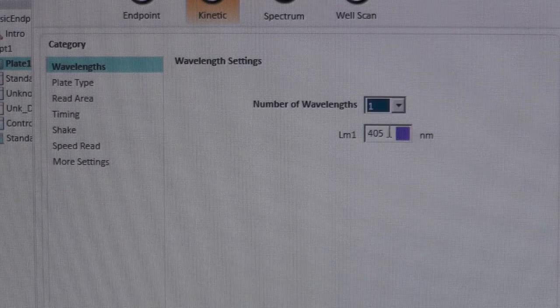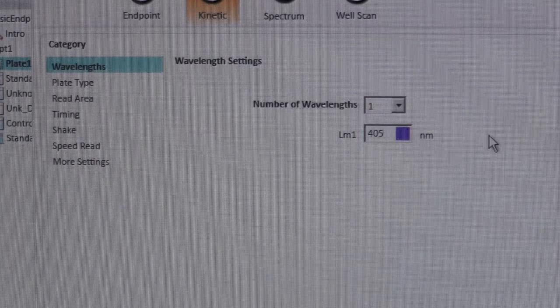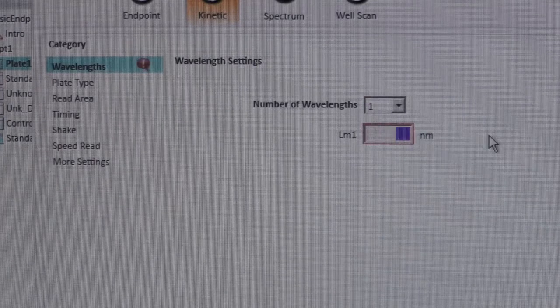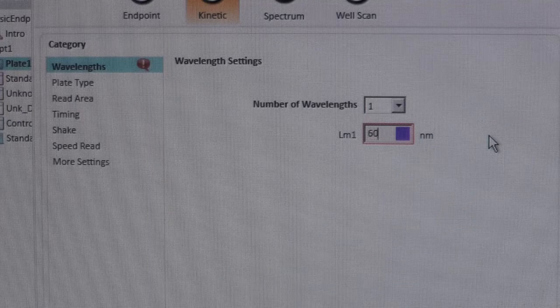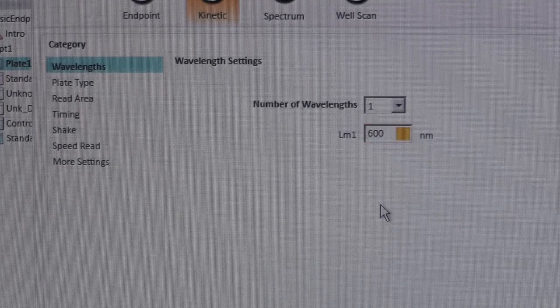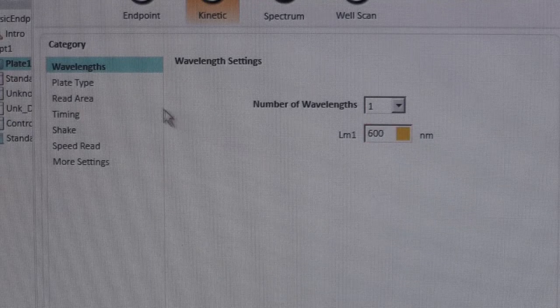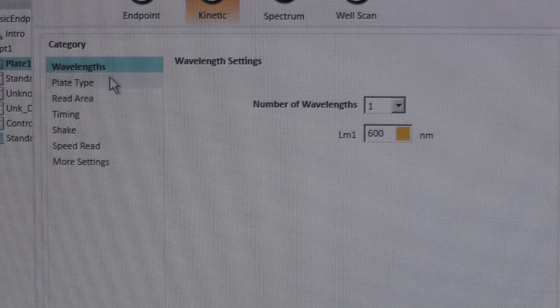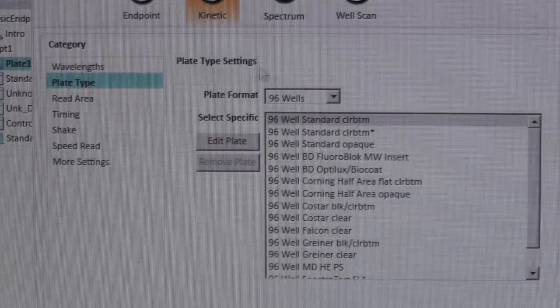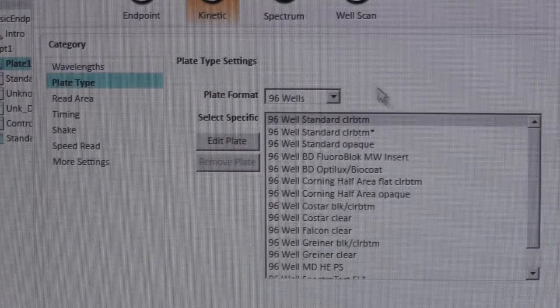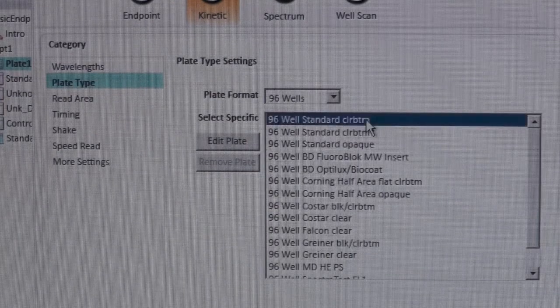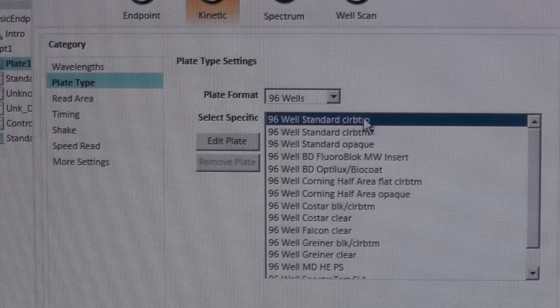Next, select the wavelength you would like to use. 600 nm is commonly used to measure bacterial cell concentrations. For Plate Type, select the first option, which is the 96 well standard clear bottom plate.